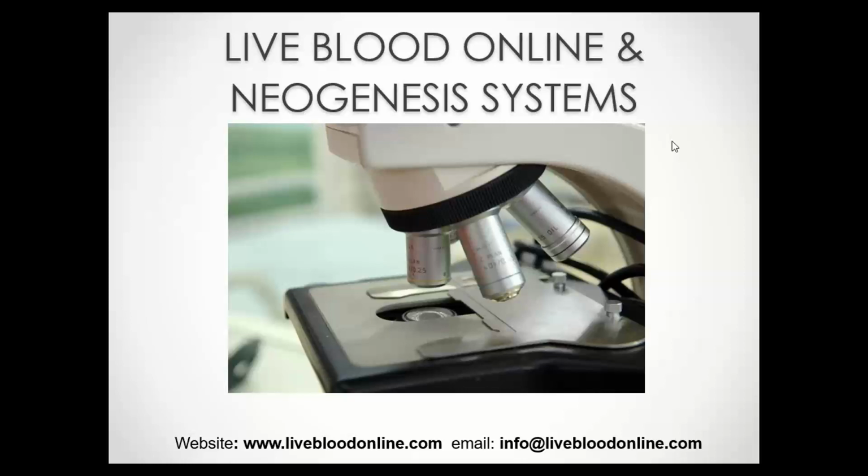We actually see the opposite of what is suggested here in practice. Patients tend to present with a very specific mix of anomalies that don't really tend to change unless the appropriate course of treatment is completed. So they would have a list of perhaps 10 anomalies at the first appointment, and if they don't make the necessary changes, we will tend to see the same 10 anomalies when they come back, even if it's several years later. It's almost like a metabolic or functional fingerprint that we're seeing, and it really won't change unless very specific steps are taken to address those anomalies.